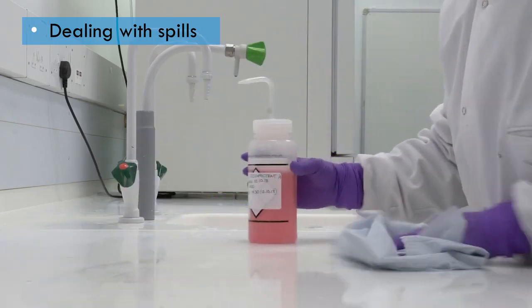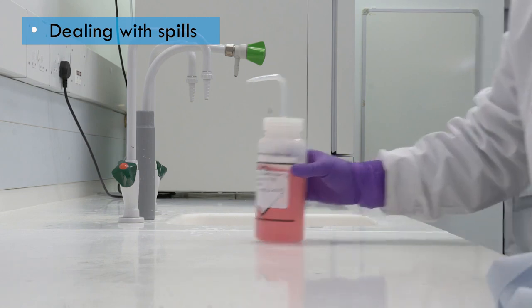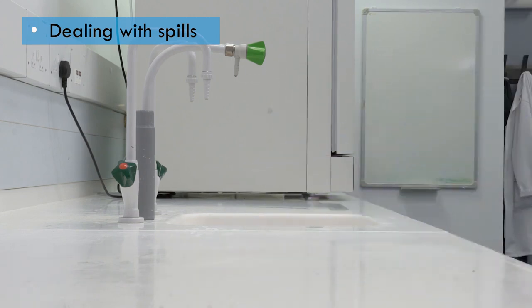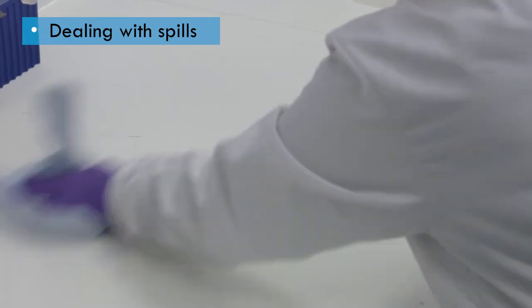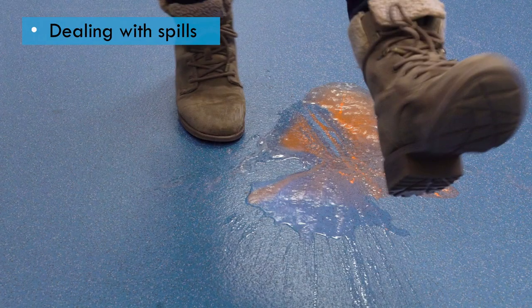It should be within its shelf life, of the correct concentration, and left on the surface for the correct contact time without drying out. After disinfection, the surface must be dried before resuming work. This is particularly important on floors to avoid slipping on a wet surface.